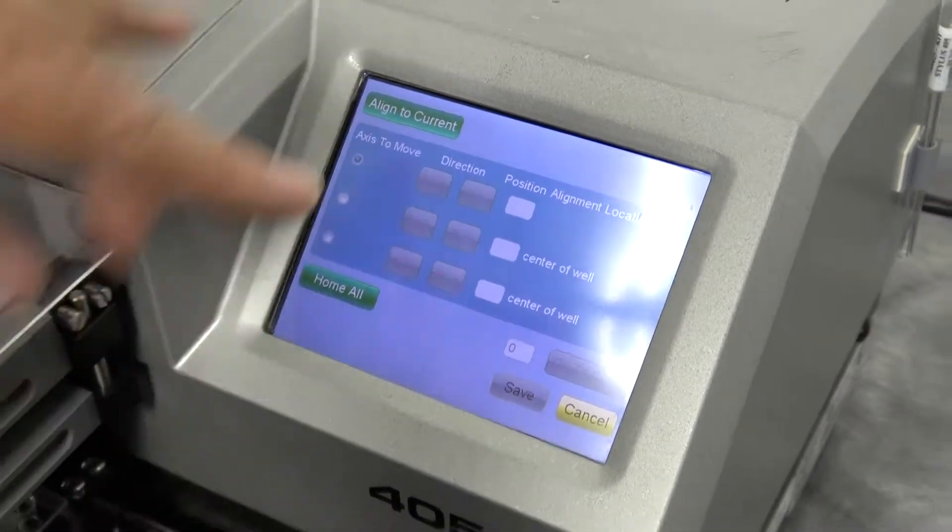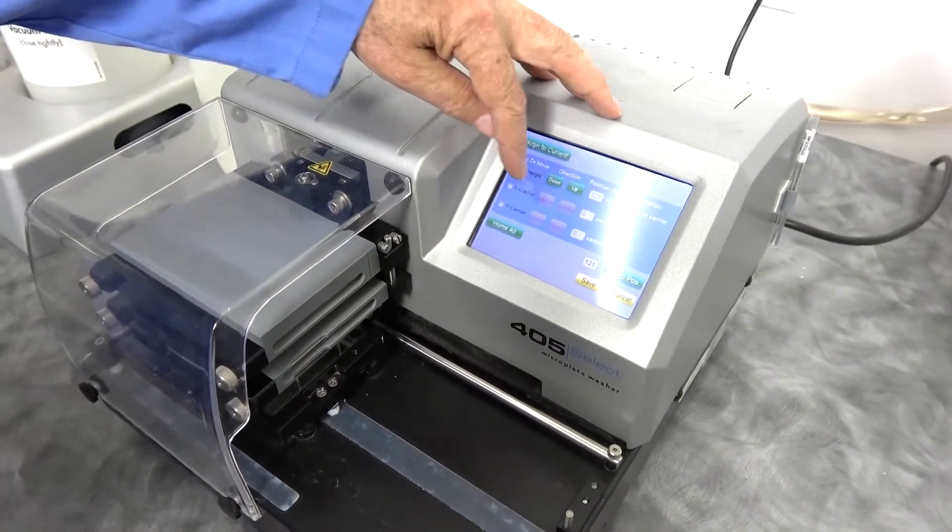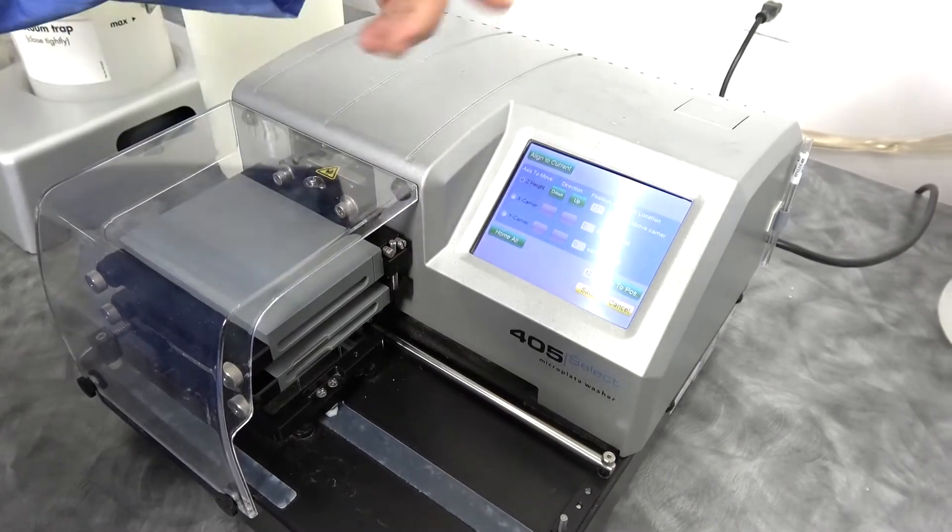So you align the current. You tell it how much you want to go over, up, down, sideways. Go to that position, and you can tell it to save.